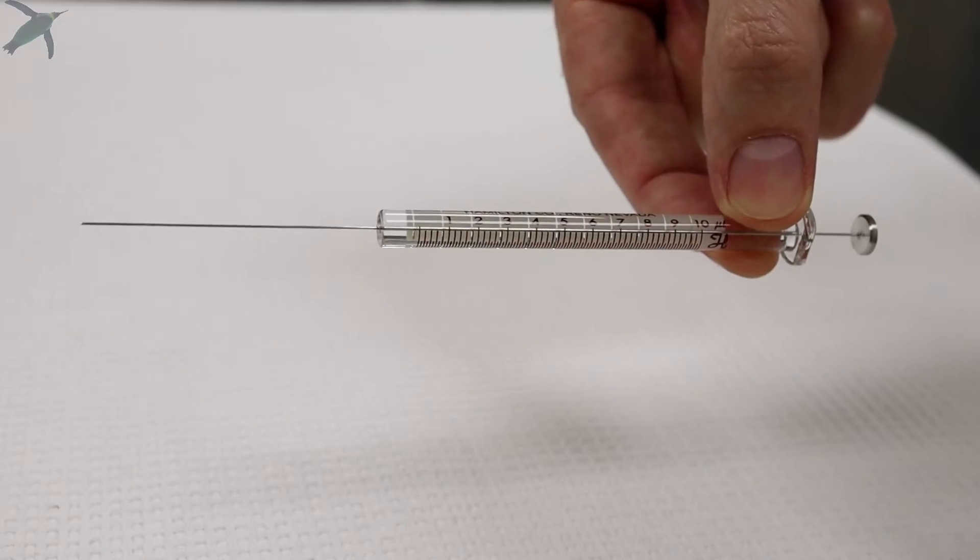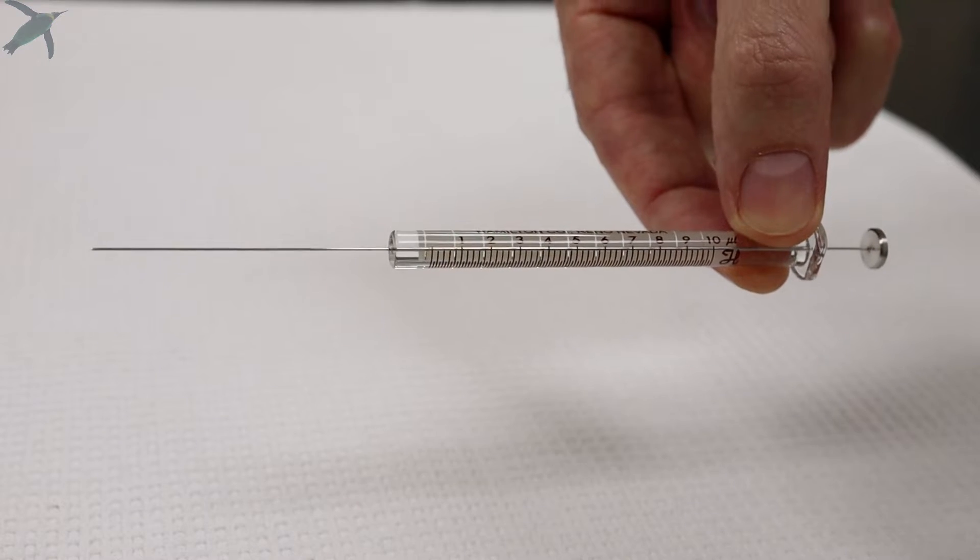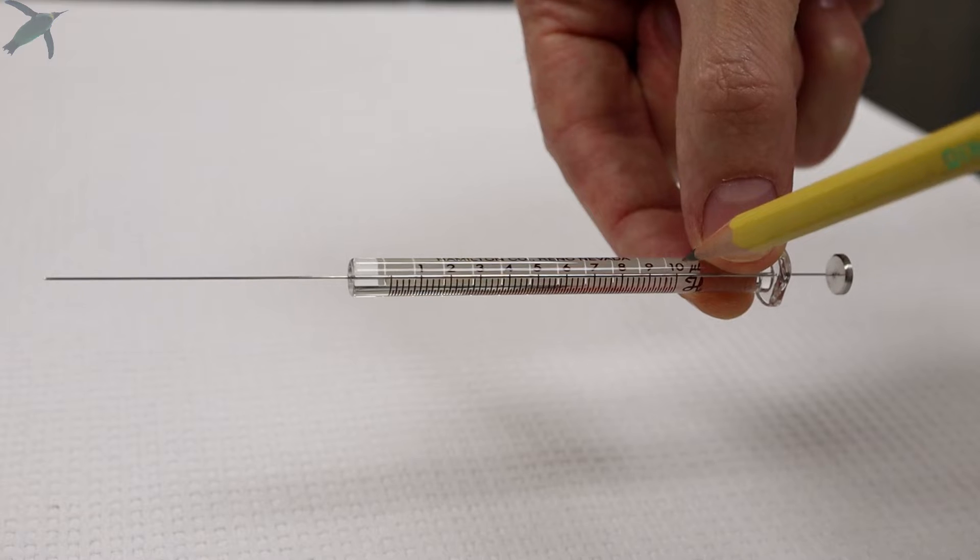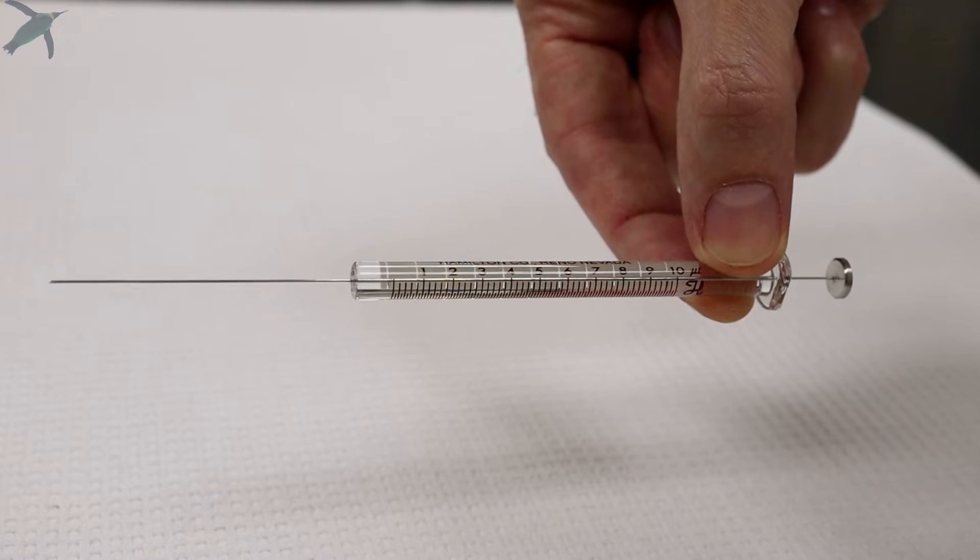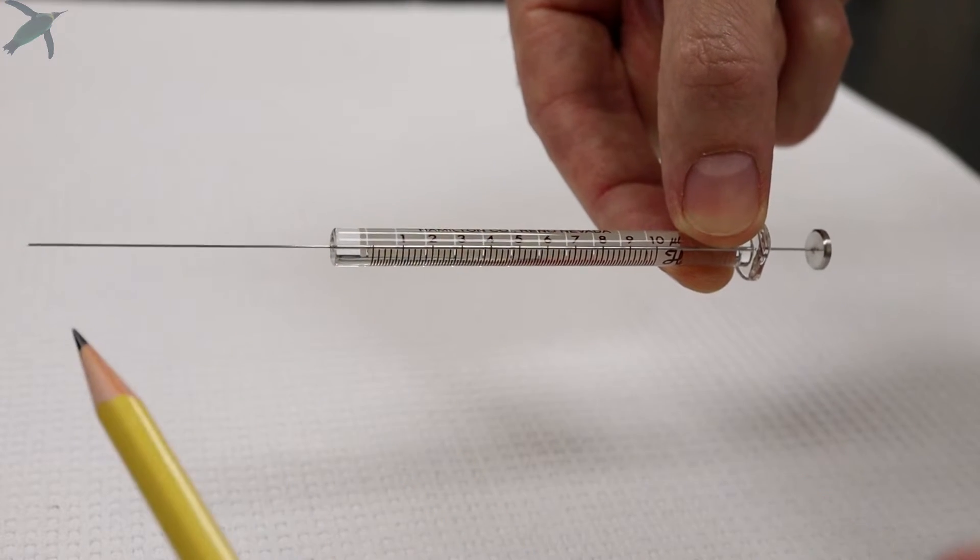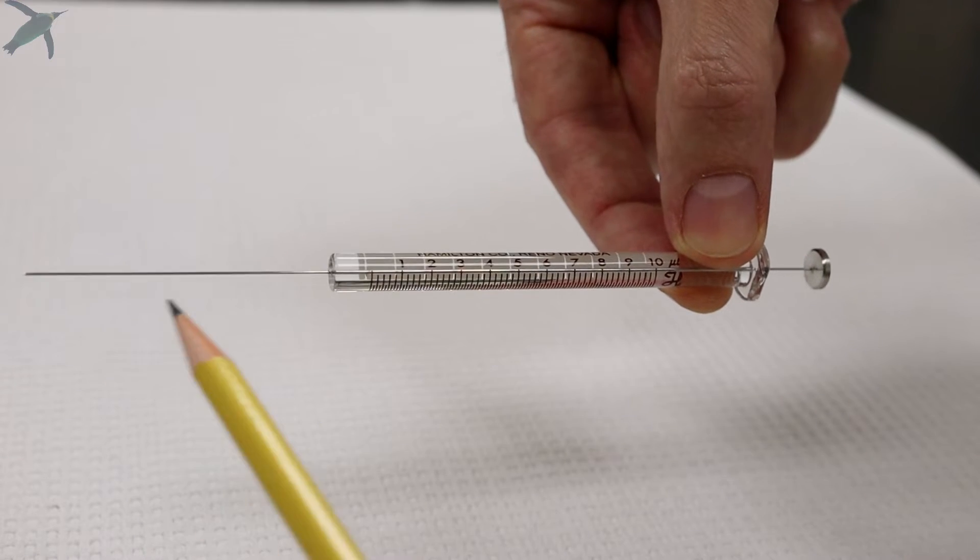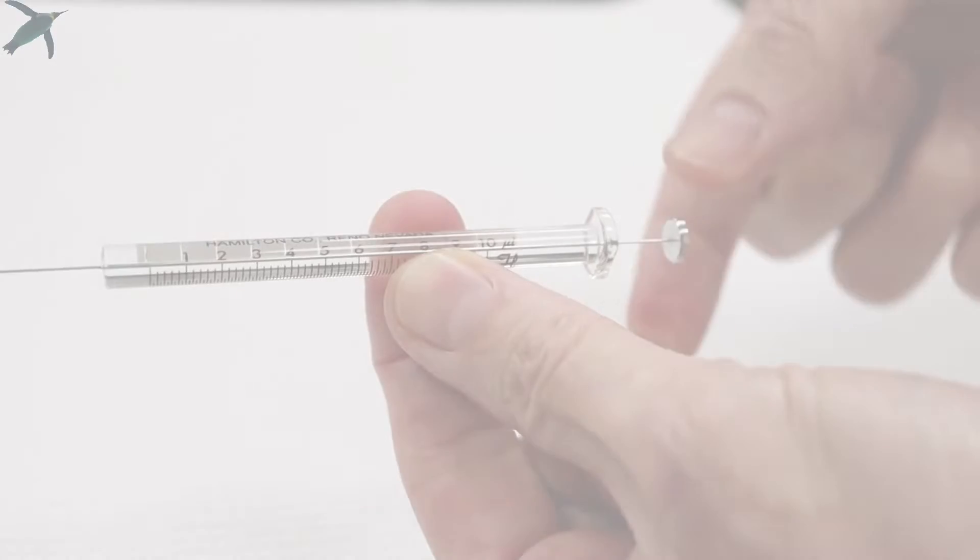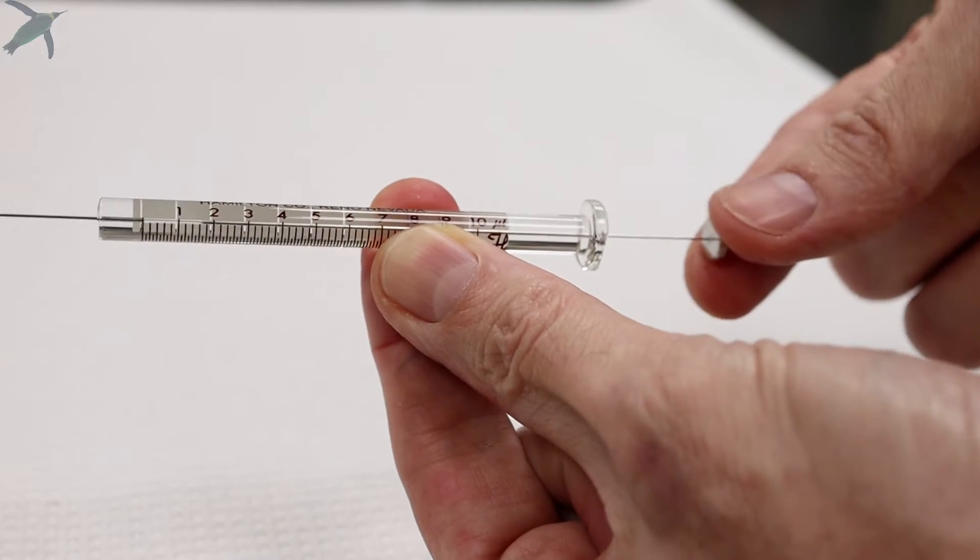To load your sample, you will use a microsyringe and you will inject approximately one microliter of sample. This is a 10 microliter syringe. The syringe is composed of three parts: it has a needle, a barrel which is the glass part, and a plunger which is this stainless steel part.